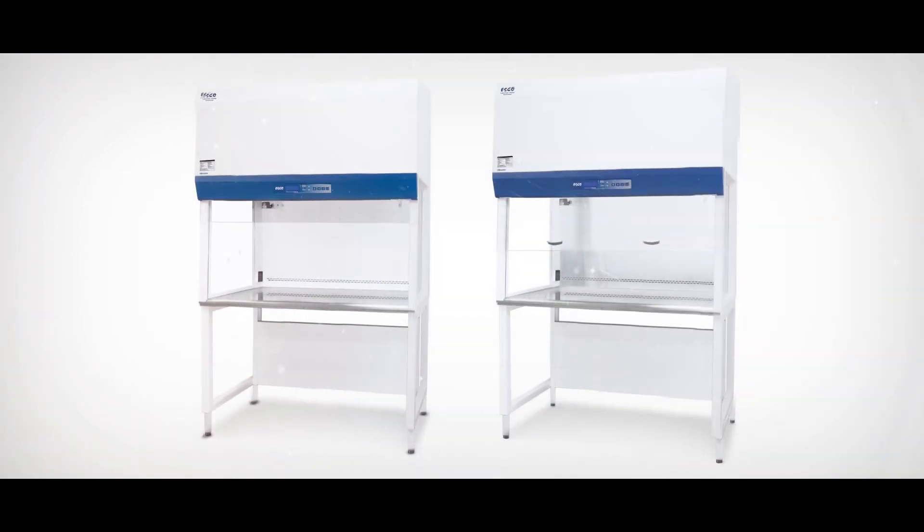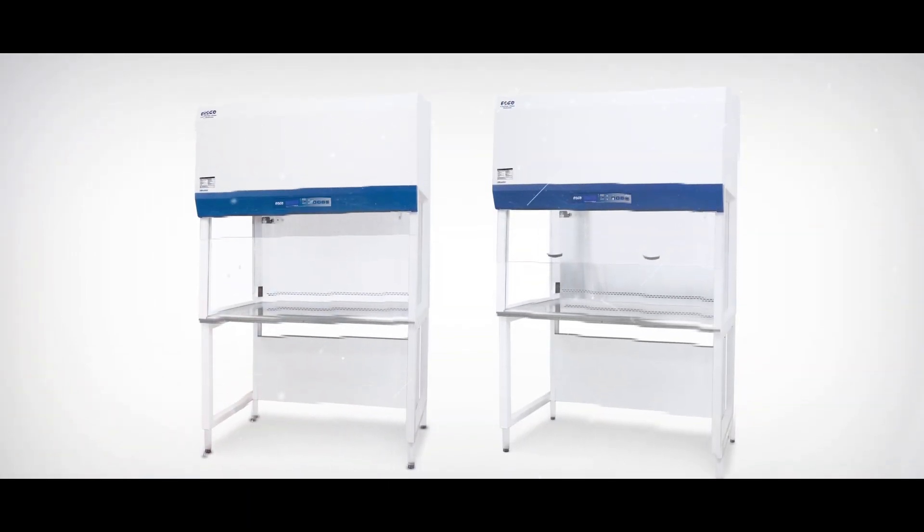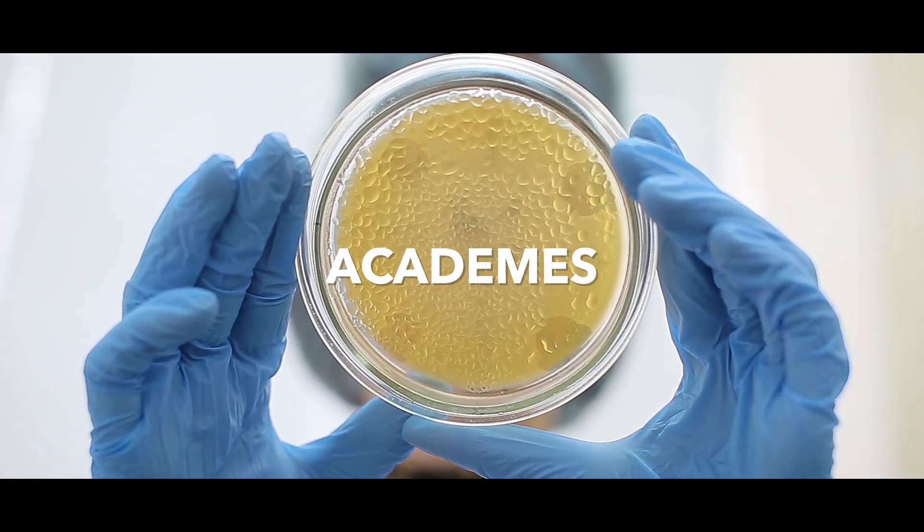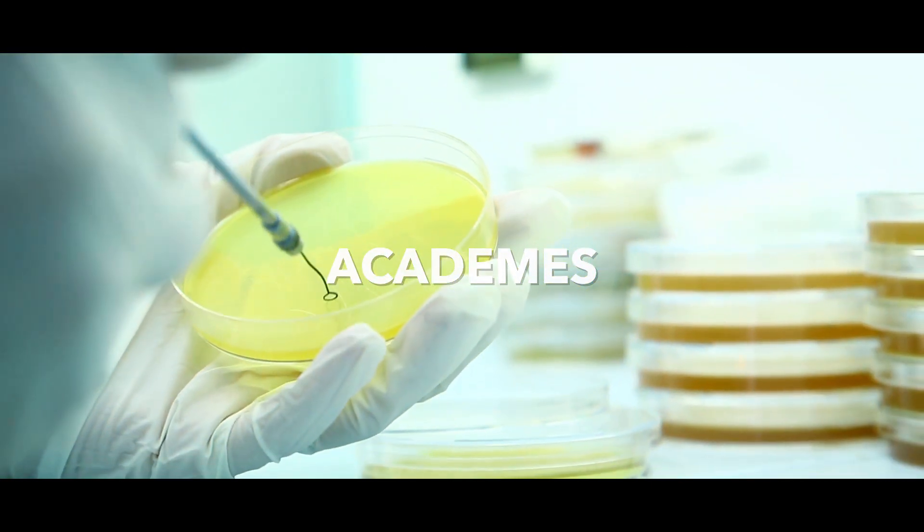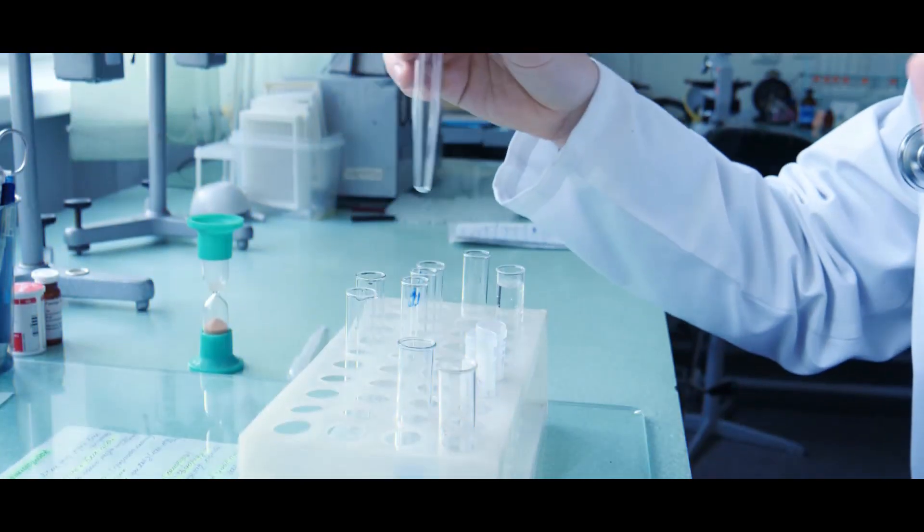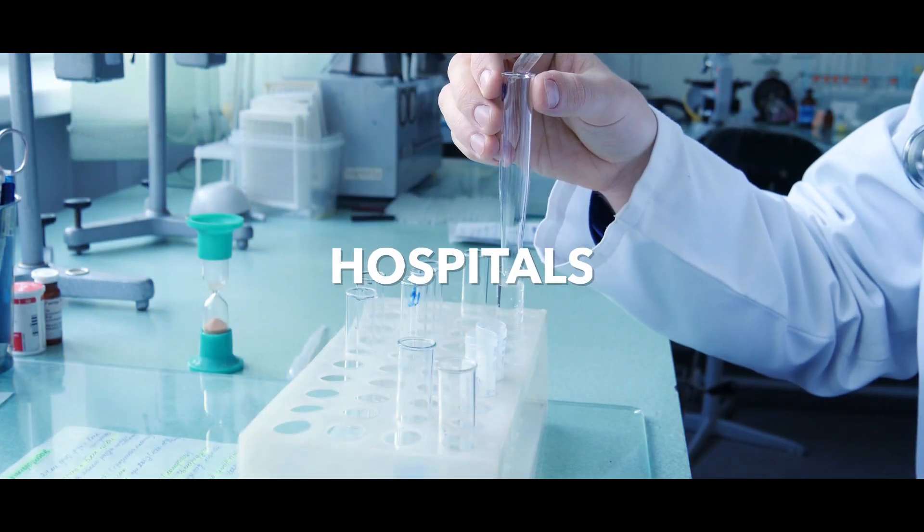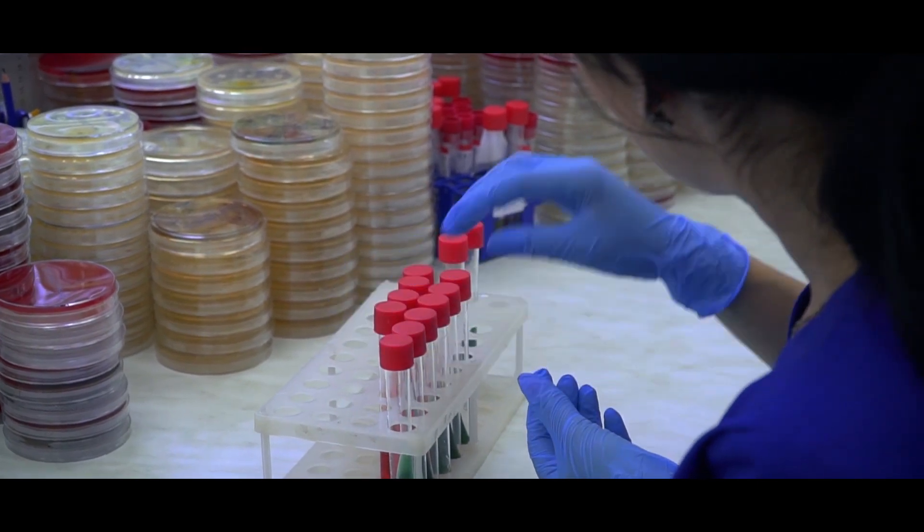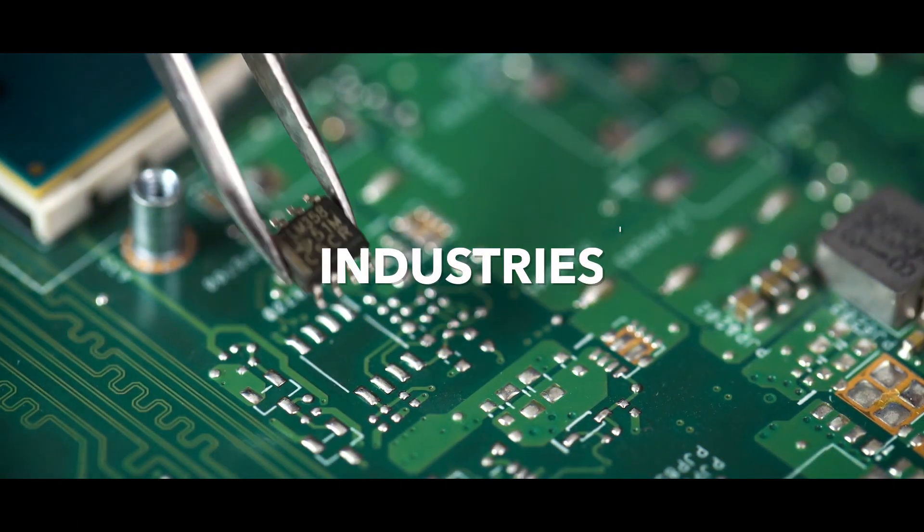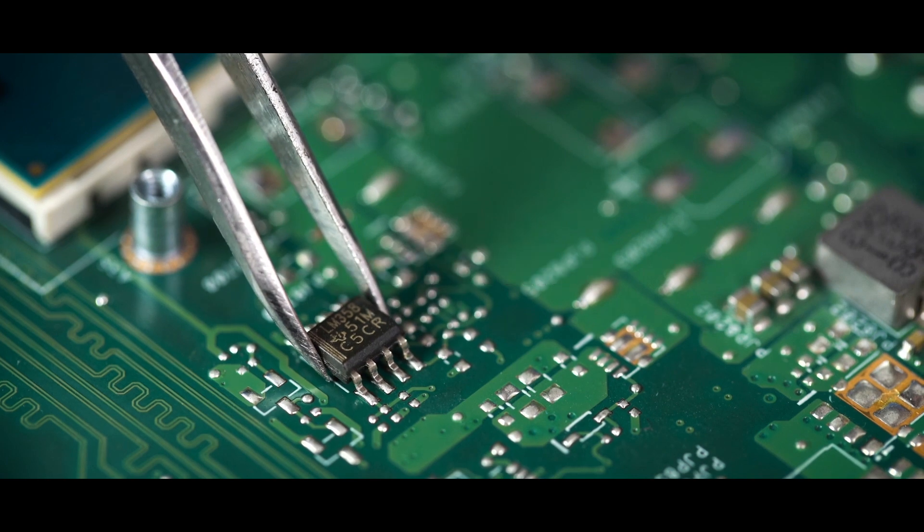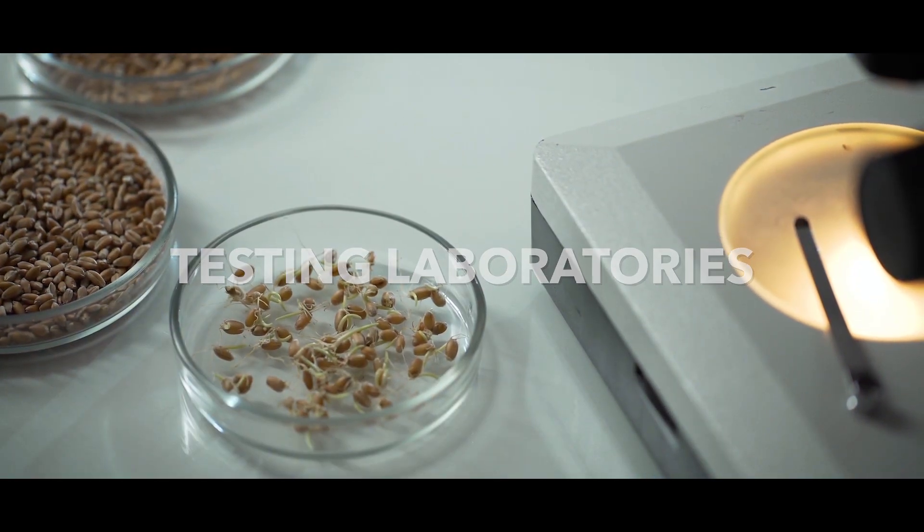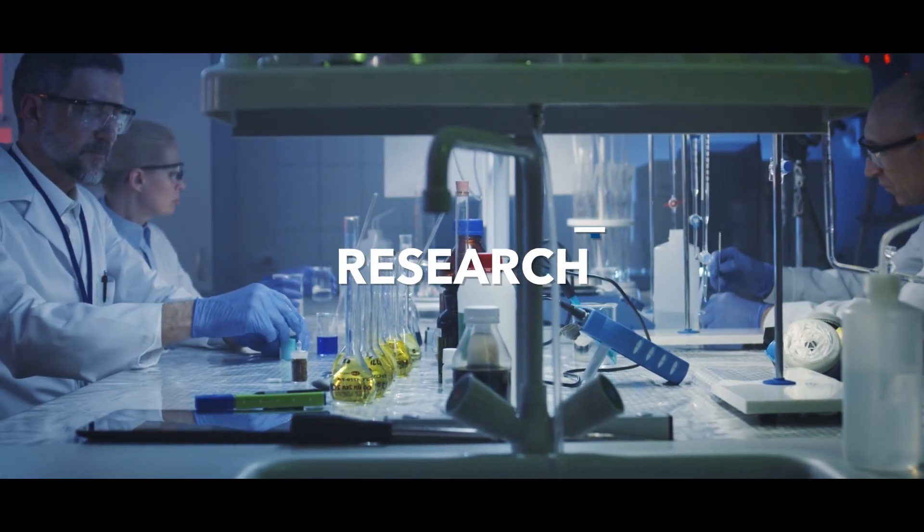The vertical laminar flow cabinet has a wide range of applications. It can be used in academics for media preparation and culturing of non-pathogenic microorganisms; in hospitals, commonly found in laboratories and pharmacies for compounding non-hazardous drugs; in industries for electronic inspection and assembly; in laboratories with quality assurance departments; and in biotechnological research.